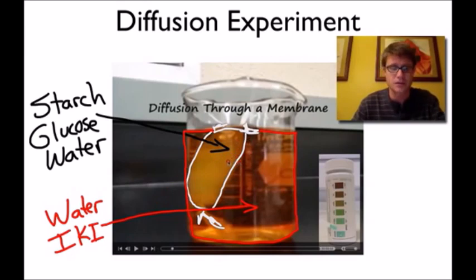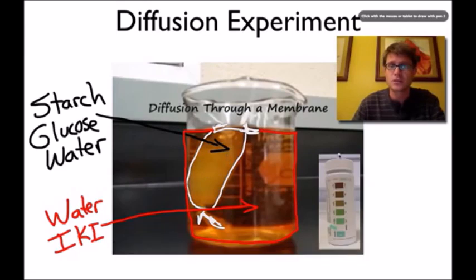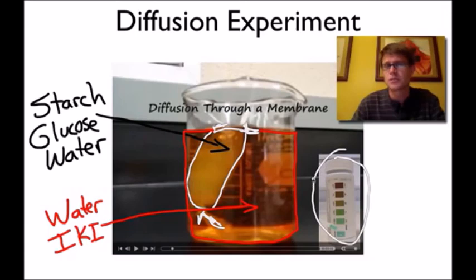All right. The other thing you normally do before you start this is look at the presence or the absence of glucose. You do that using these glucose test strips right over here. They're used to monitor glucose levels. If you're a diabetic, it's a good way to see how much glucose there is in your urine, because high glucose levels are an indicator of problems with regulating blood sugar.